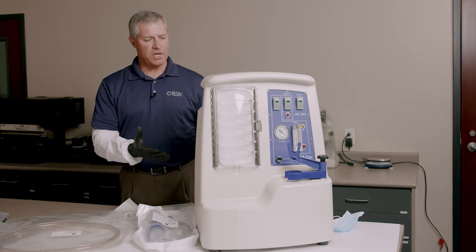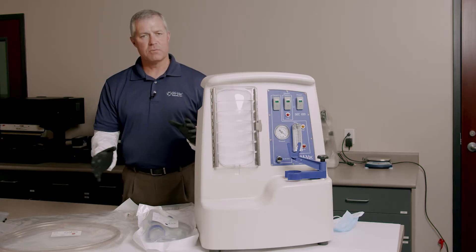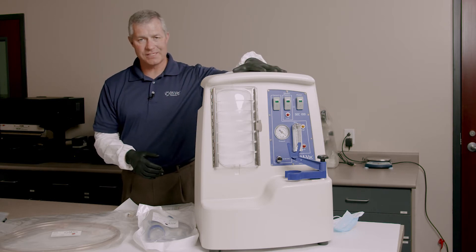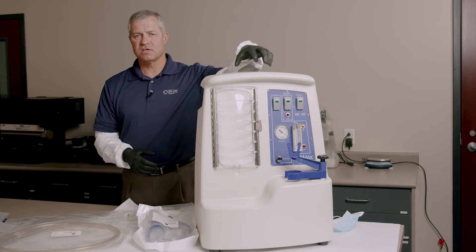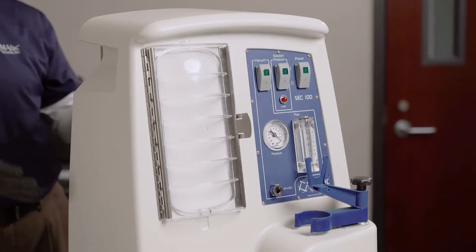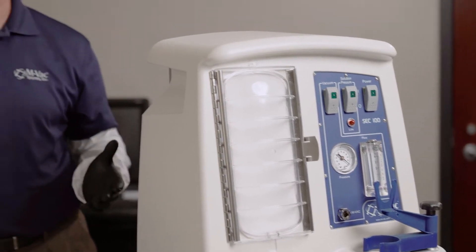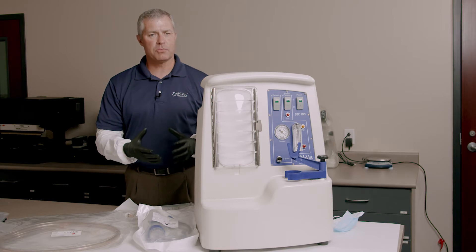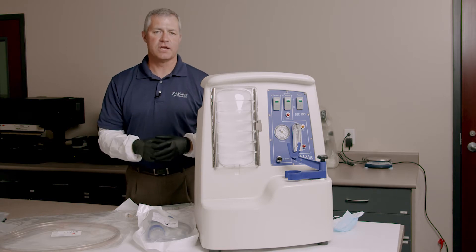First of all, I want to show you the different components of the MVAC. This is what we call the support equipment case, or SEC. This houses the vacuum pump, the solution delivery system, and this is your durable item. The rest of it are consumables, and you need four primary consumables to take a sample and then filter it and concentrate it.